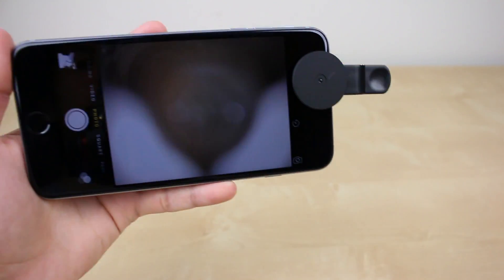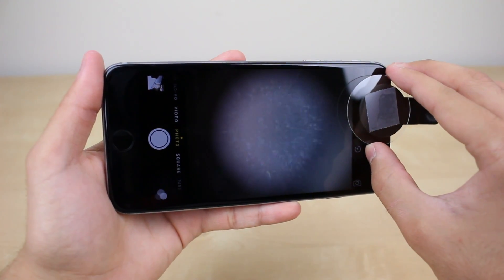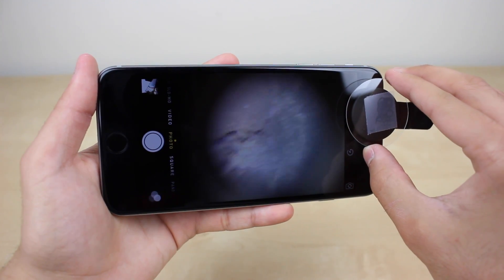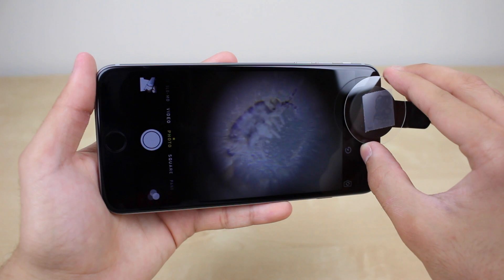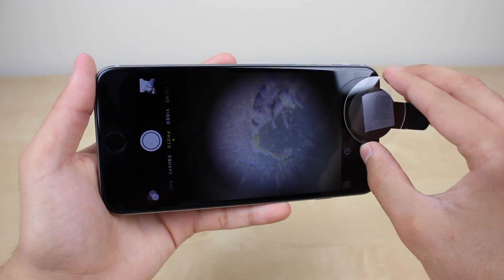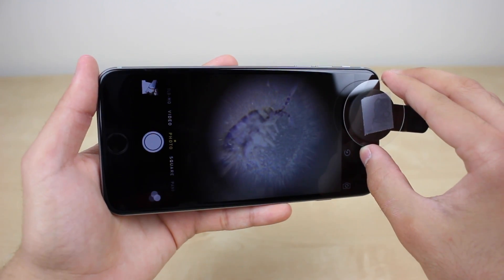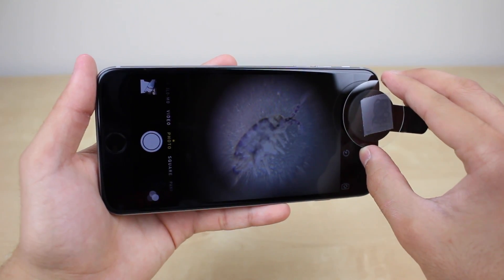There is a third way to use this microscope for bigger subjects that might not fit in a slide. For things like insects you can use the universal clip, which can be attached to the back or front facing camera. Then you place one of the circular slides with the subject attached to it, and as you can see, this method makes it easier to move and display the part you want. Note that I am not using the light source when using the front facing camera because it is easier that way.